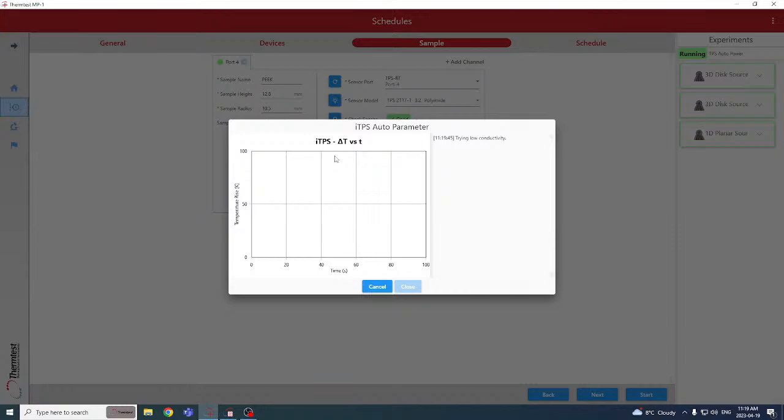So what we're looking for with our parameters of power, we're looking for a nice clean signal free of noise, and from our test time we're looking to stay within the dimensions of the sample. Additionally, and if you purchase an instrument, this is part of the training, we manually teach you how to select these parameters as well, but the ITPS does that for you.